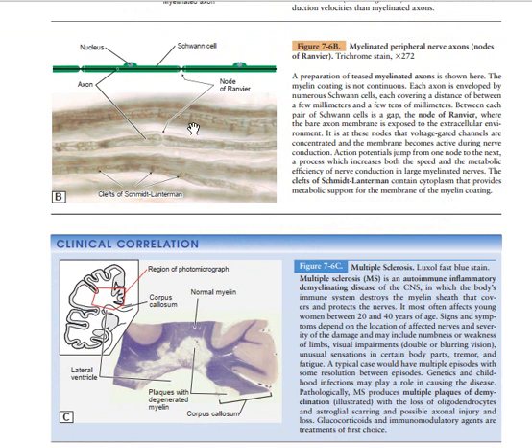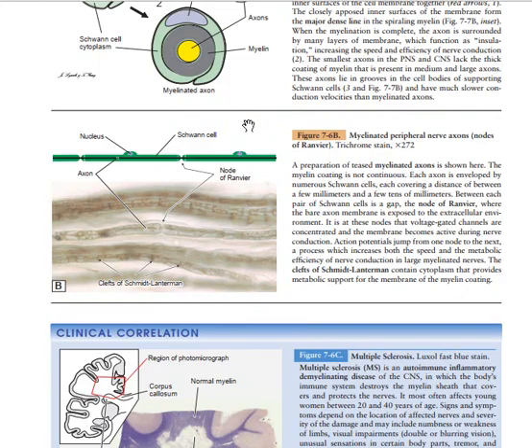Now this is a myelinated peripheral nerve on longitudinal section with a trichrome stain. Another stain that can be used to visualize myelin is trichrome, and this trichrome is a dark color, just like what you have seen above. So here you visualize the nucleus. This is a schematic representation of the nucleus. You have the Schwann cell, you have the node of Ranvier. But here on the histologic section, you also see it.